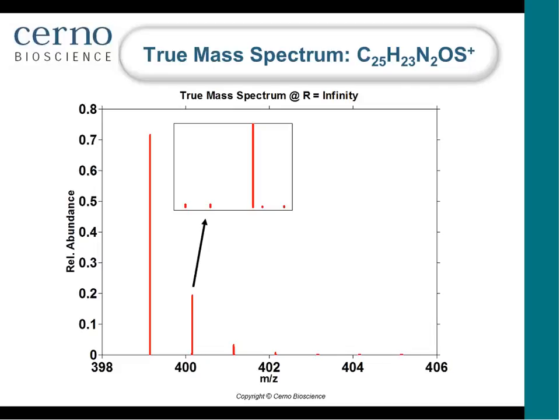Now, if you go to a higher isotope, such as A+2, the intensity is weaker, but you certainly have even richer information because there are many different ways to combine various isotopes of the atoms to form the A+2 isotope cluster. And they are extremely important in determining whether you have a compound that contains sulfur, for example, or some other elements, and how many of them you might have. And those are the spectral information that get lost in the conventional processing through, for example, centroiding.